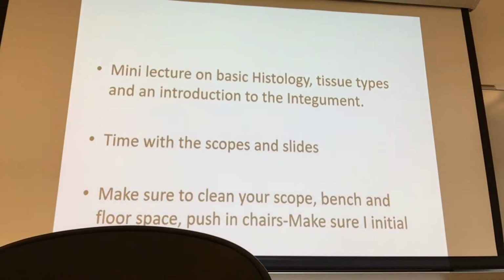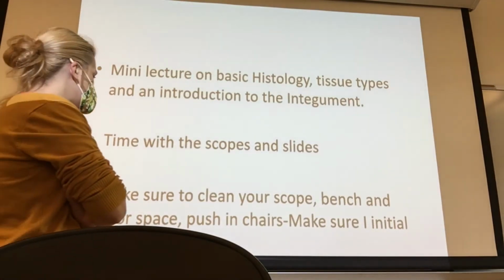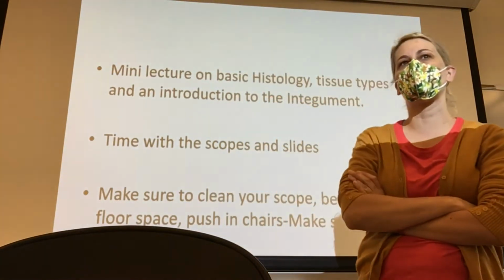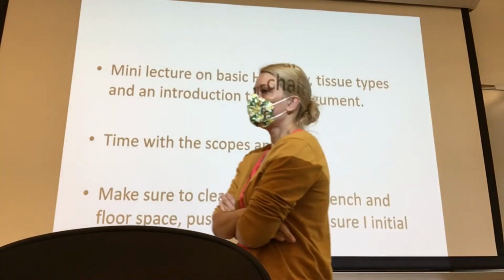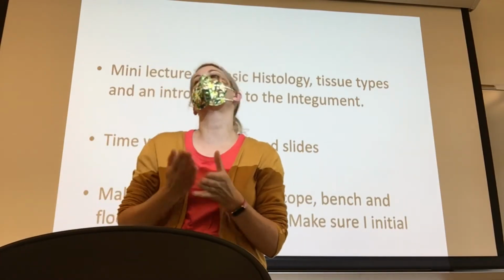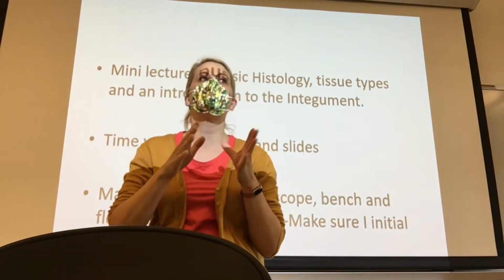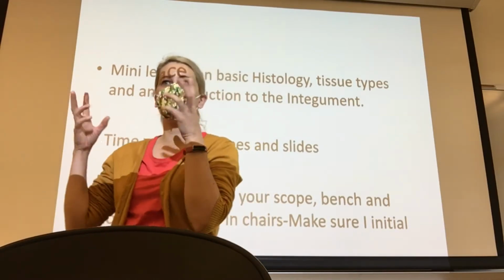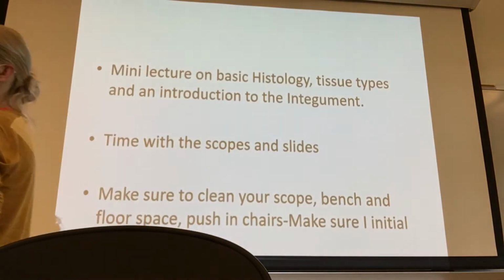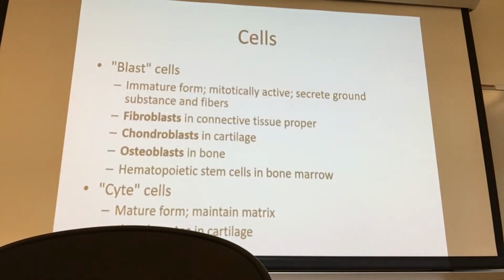There's a way we handle the scopes and put them all away and clean the benches and all of that. I think you probably remember that from your biology lab days, but if you need some help, I can help you get that refresher. It needs to be done right every time. Then I will actually check your microscope back in, make sure all the settings are where they need to be and that it's clean the right way. Okay, no big deal.